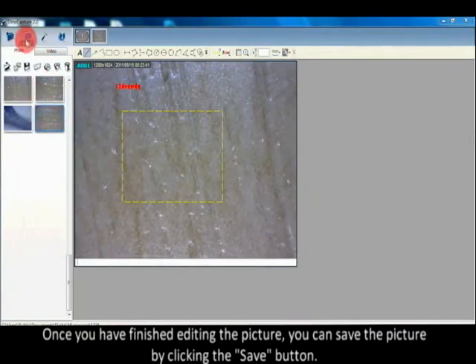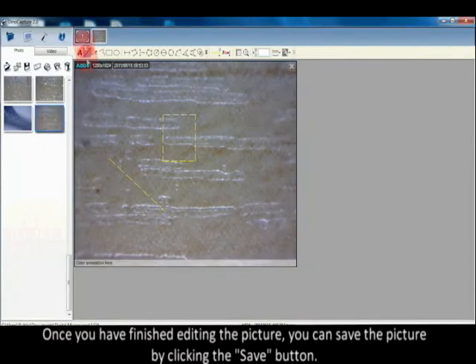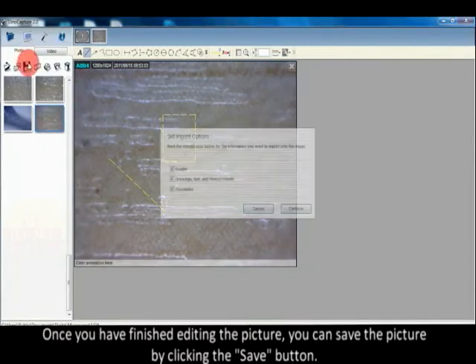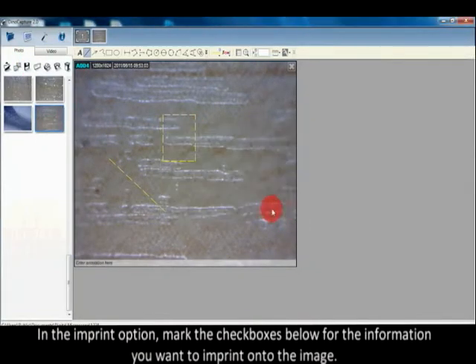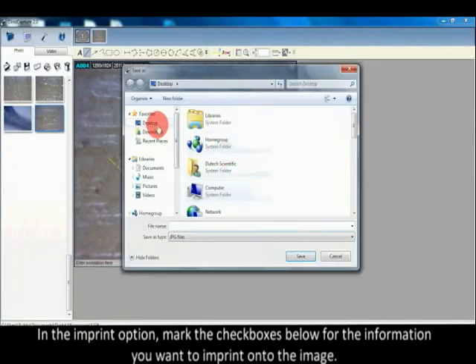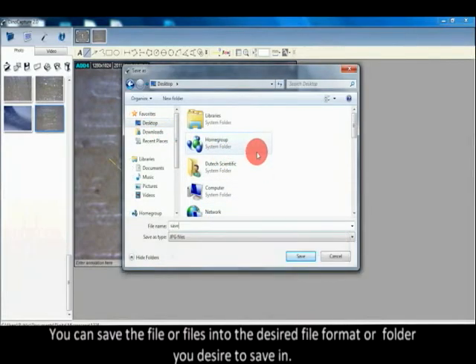Once you have finished editing the picture, you can save it by clicking the save button. In the imprint option, mark the checkboxes below for the information you want to imprint onto the image. You can save the file or files into the desired file format or folder.